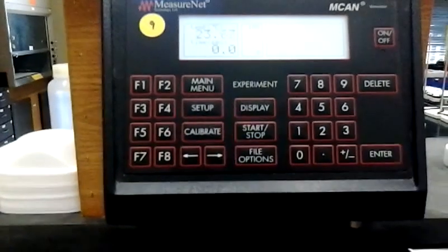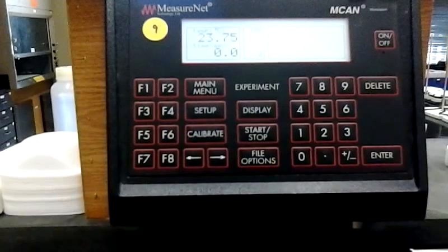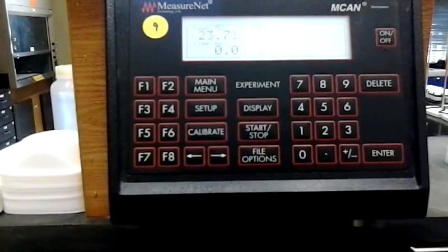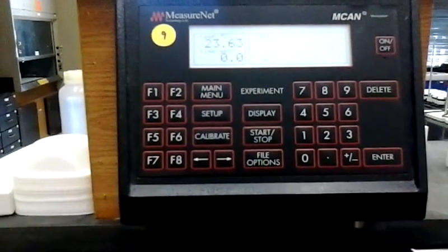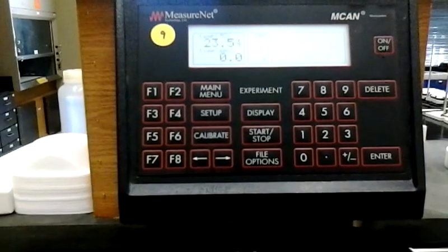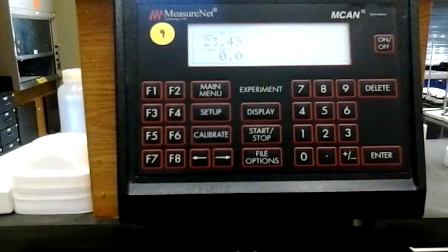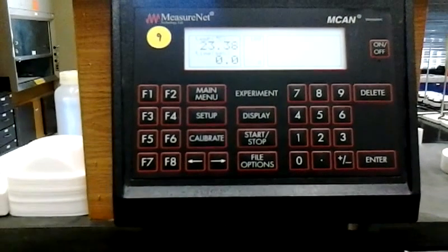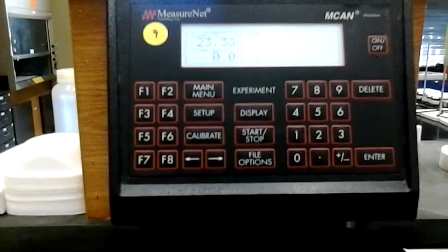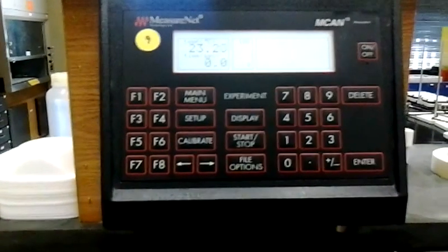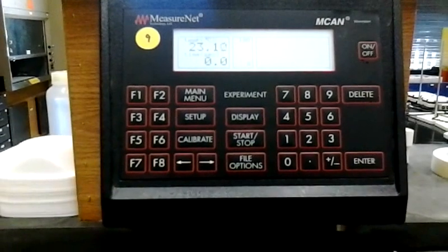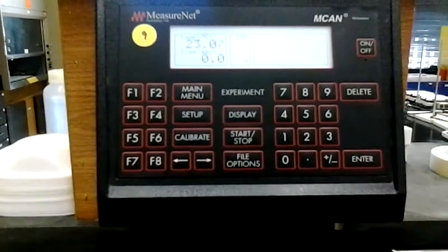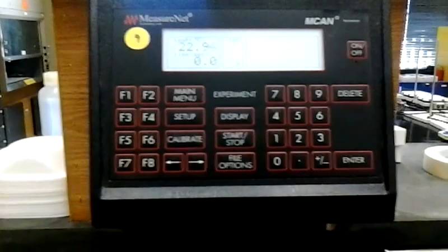So once you place your temperature probe into your experiment vessel, once the temperature has stabilized, record the temperature of your experiment. And so that is how you calibrate the temperature probe and use the temperature probe on the MeasureNet system.